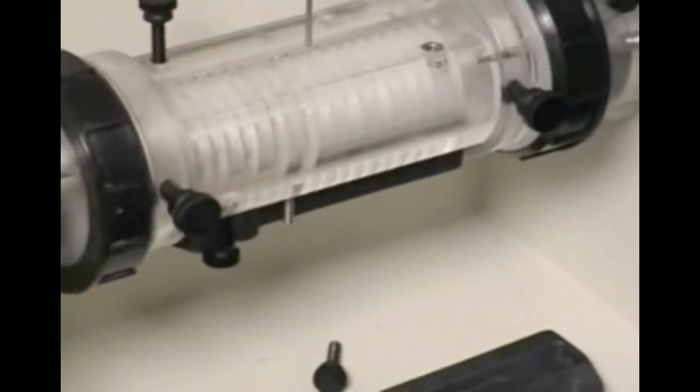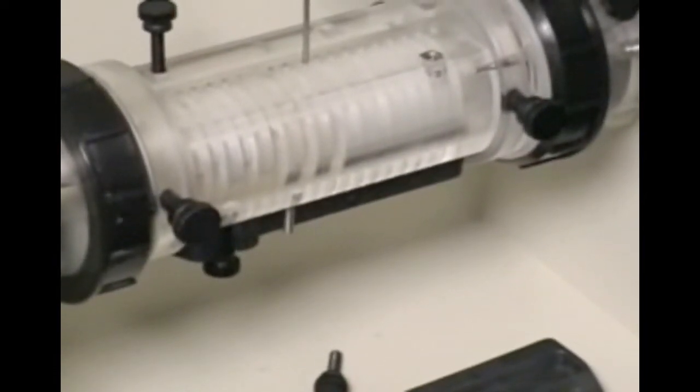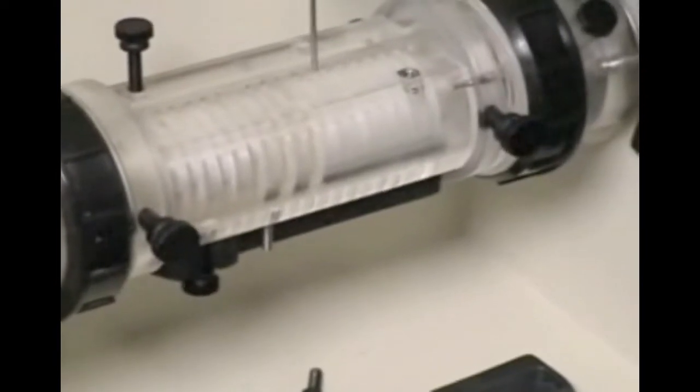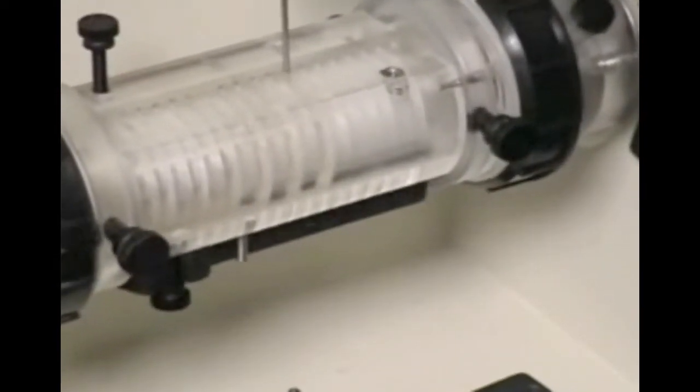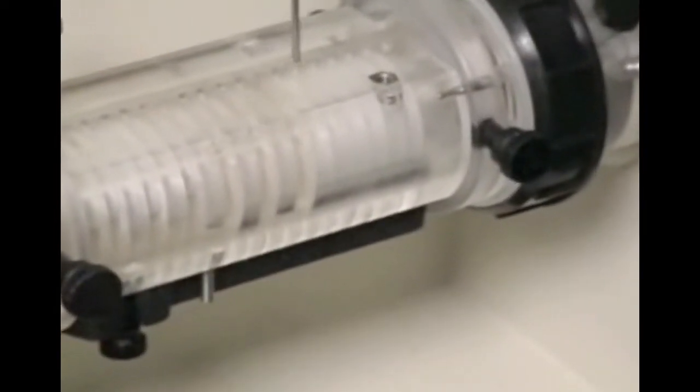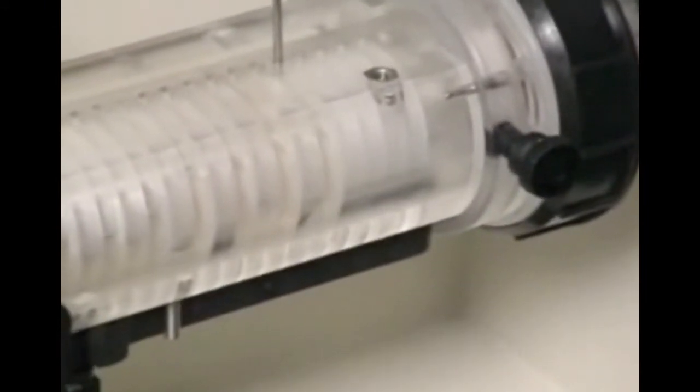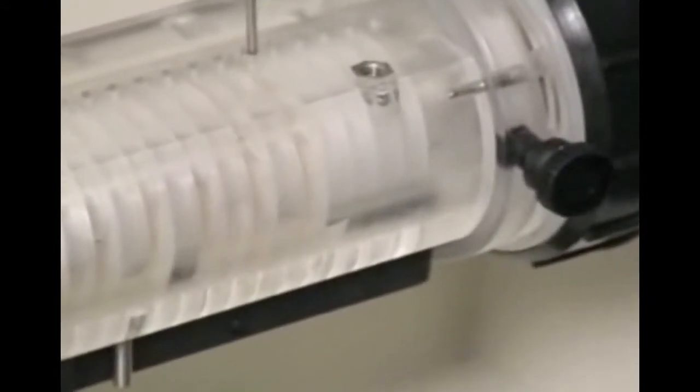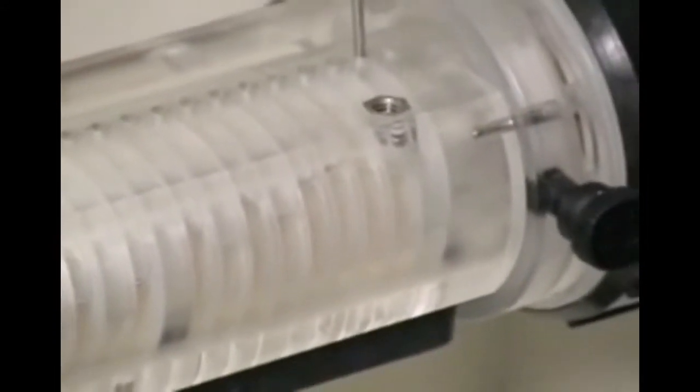For the standard focusing chamber, the minimum sample volume must be sufficient to cover the cooling finger. Generally, 35 milliliters is sufficient. The standard focusing chamber also holds a maximum of about 58 to 60 milliliters of sample. For the mini focusing chamber, always load the maximum sample volume of 18 milliliters.